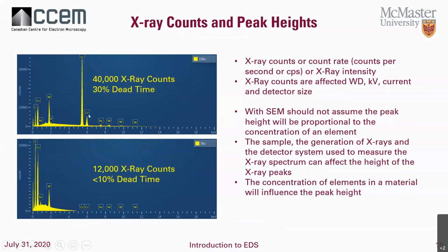But if you look here, when we went down to a lower kV, we're getting more contribution from the carbon that's present on the surface as a coating, or the carbon that's within the material.